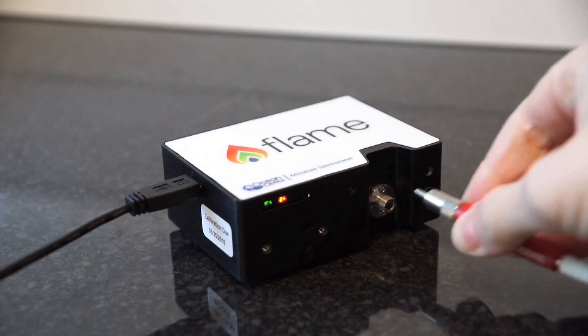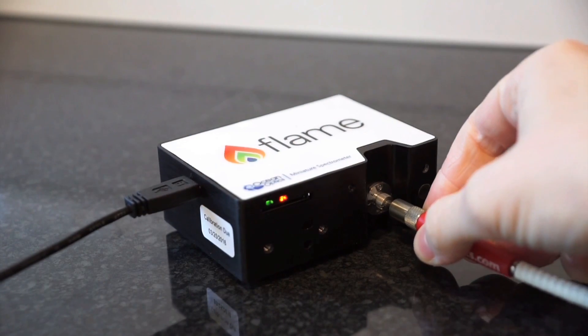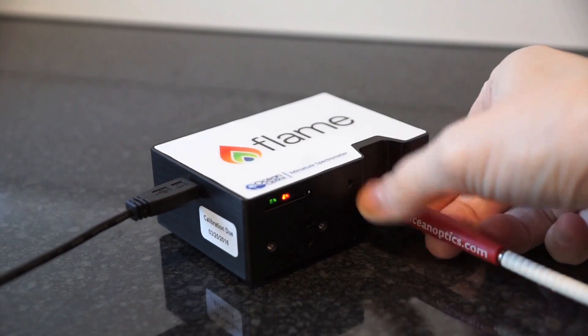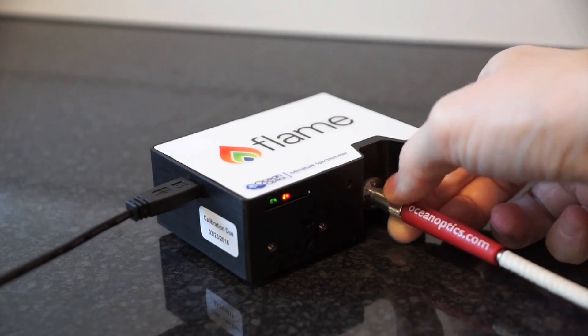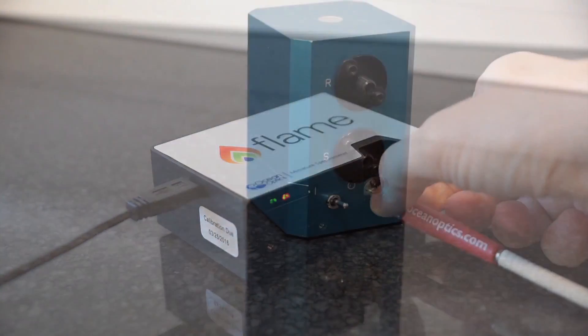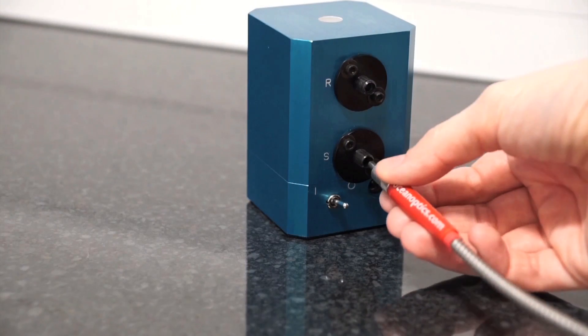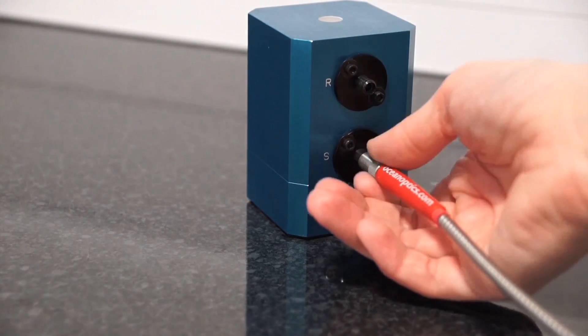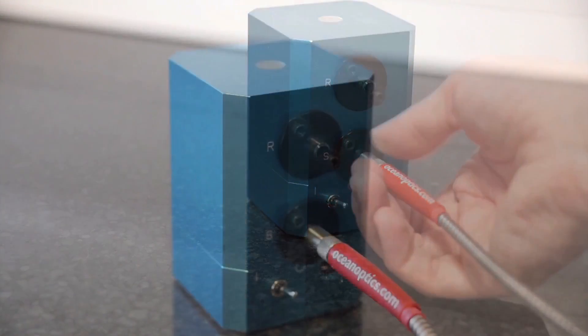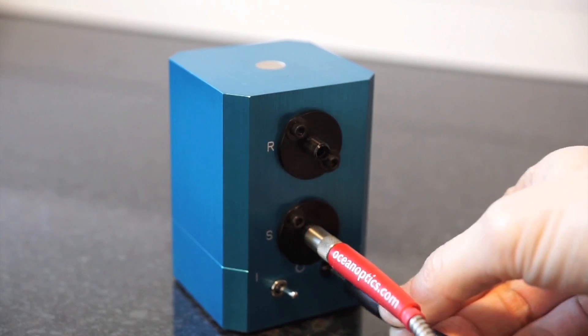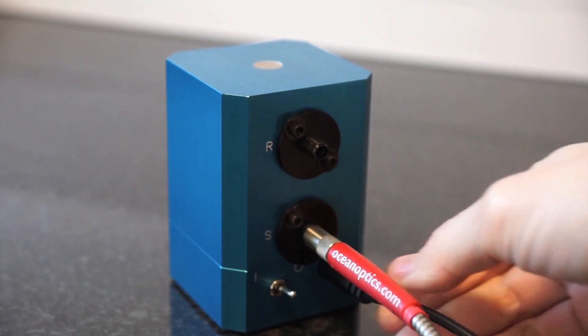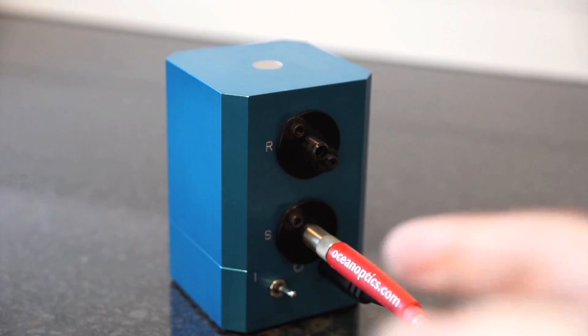To set up, simply attach a fiber from your spectrometer to the integrating sphere through the sample port labeled S. This is your collection fiber. If you're using the internal light source, just plug in the integrating sphere and switch on.